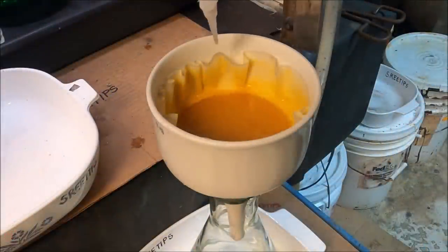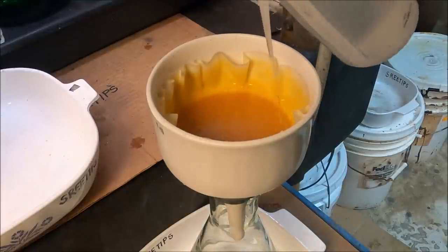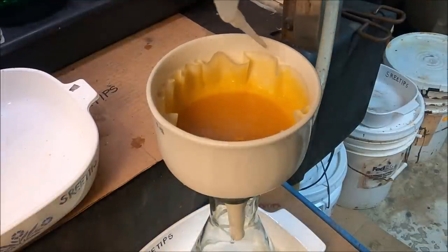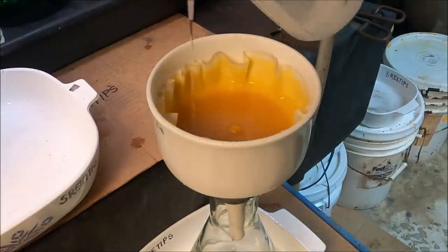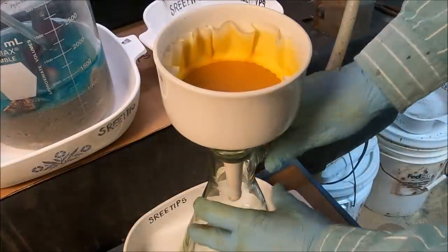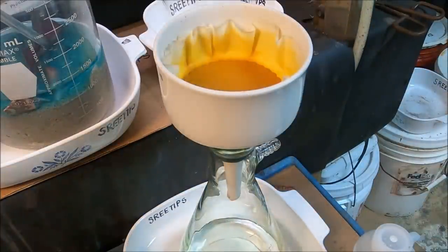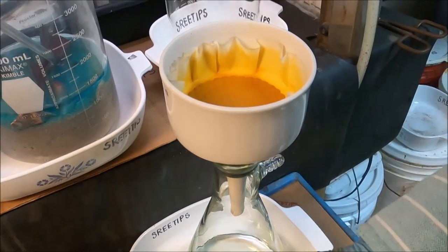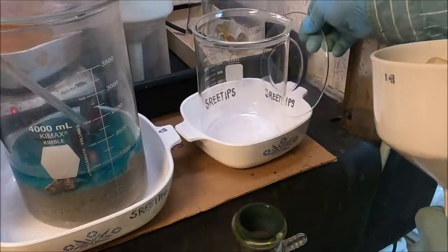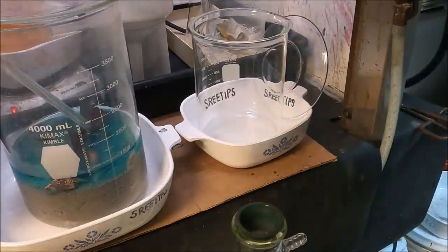Got a pretty decent cake of palladium precipitate here. I'm gonna rinse it off real good. Make sure we got all the silver off of there that we can. I've got this precipitate now rinsed out real good. And what we'll do is I'm gonna set this up here in a beaker for a minute, get it out of the way here. Then we're going to do a quick inventory of where we're at with everything here.